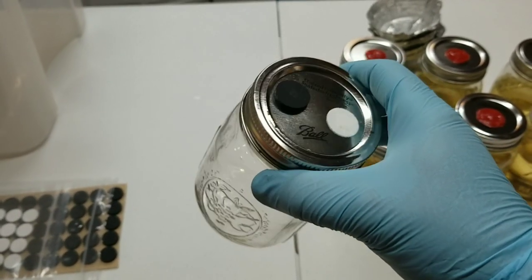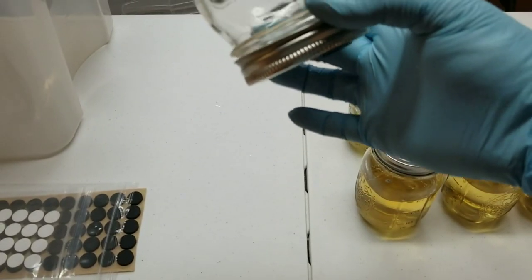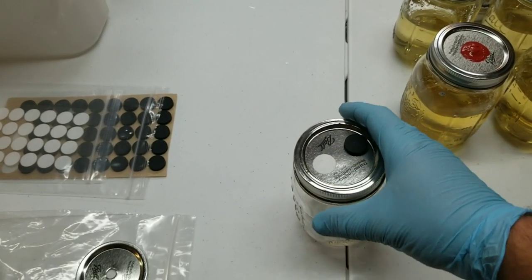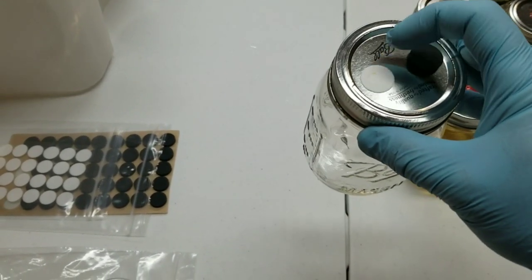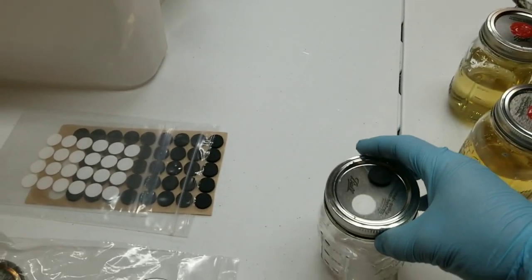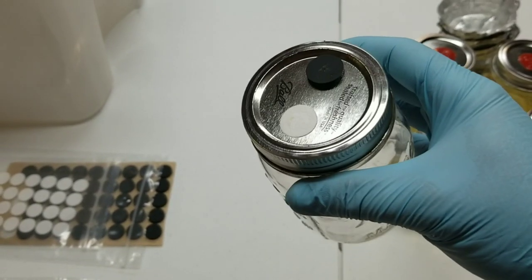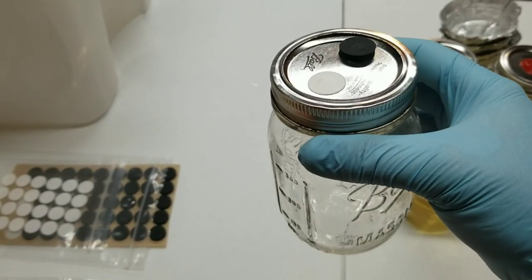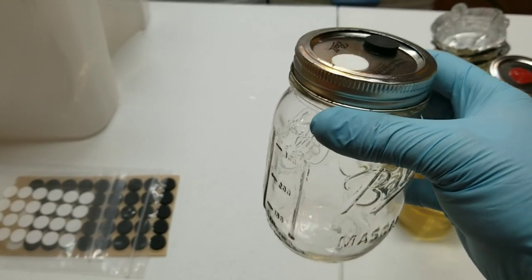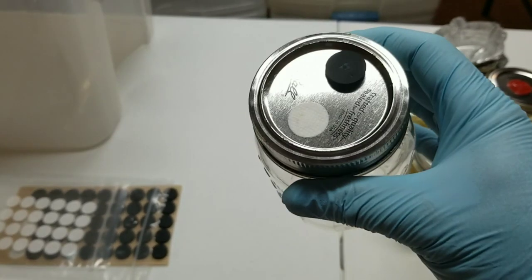Also, when you go to draw syringes out you can't turn the jar right upside down, because you can't keep getting the filter disc wet — mold will grow right through the filter disc. What I use vented lids for primarily is if you need a bunch of mycelium really quickly, or you're doing something like the mycelium flood method like we did in our cordyceps video, where you want as much mycelium as you can get out of the jar.